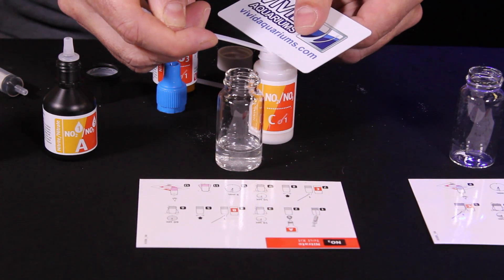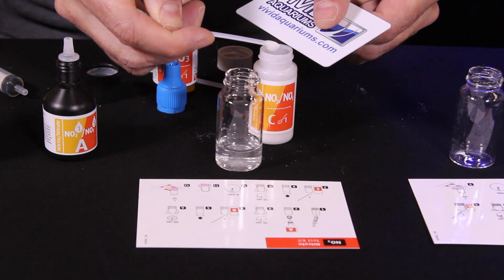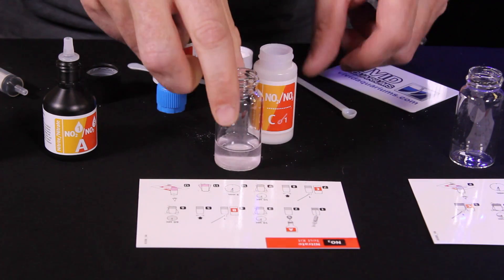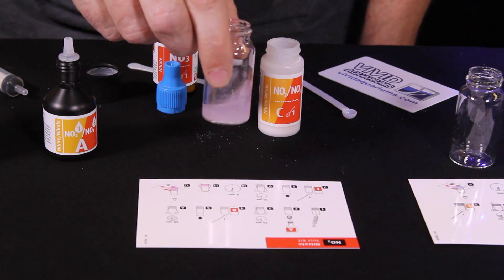Next step is to add one level scoop of reagent C. Again, use the card to level that off. Put that in and then we need to swirl for 10 seconds.